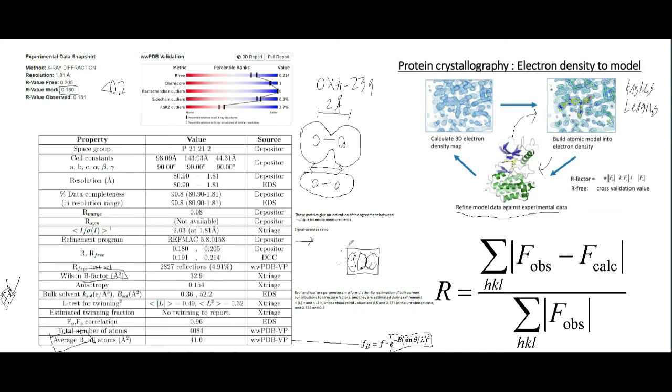So the water molecules are going to contribute to the diffraction data because water molecules are also present in our unit cell. And so this is just a measure of the contribution of our water molecules in the diffraction data. So these are all the various things that we can use for validation of our crystal structure.